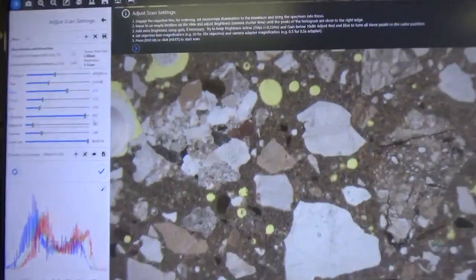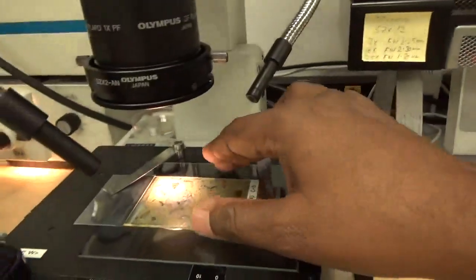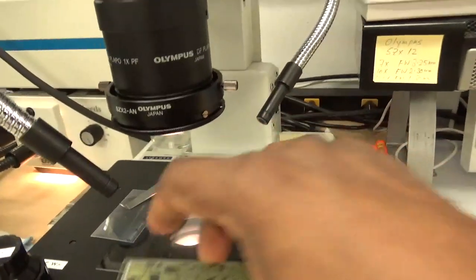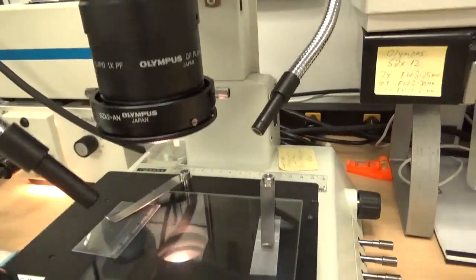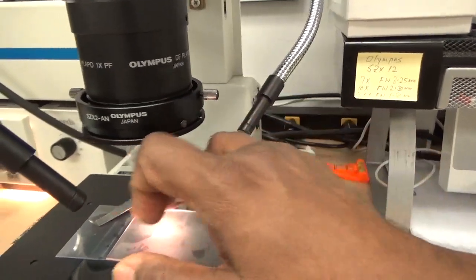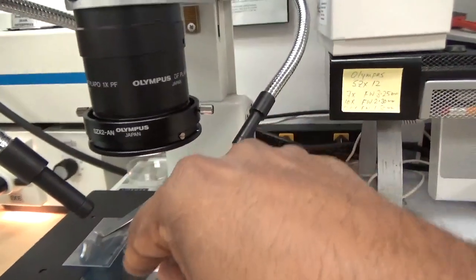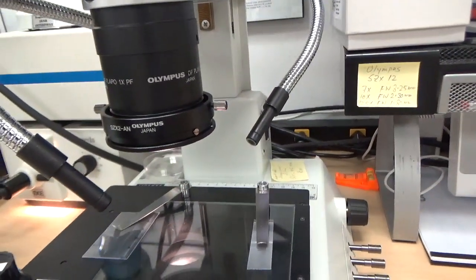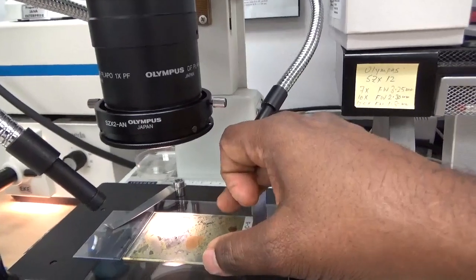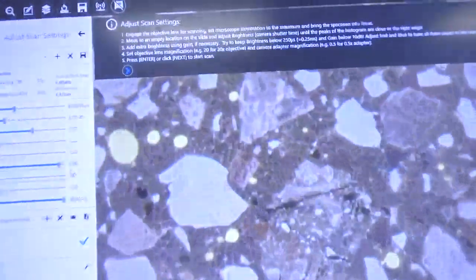So to set the preset, first you have to remove the sample and put a blank glass slide to do the shading compensation. You have to set the preset and shading compensation with this blank glass slide. But before I do that, let's put the sample back, since I want to see the brightness for setting up the brightness bar.